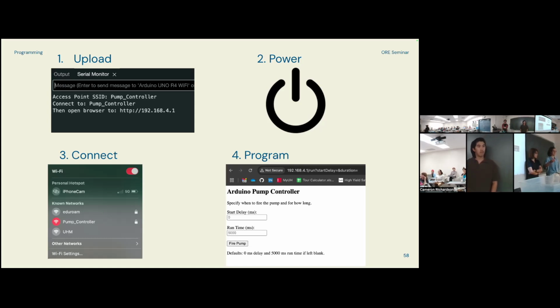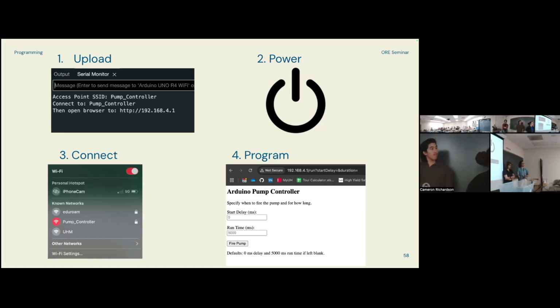You would add another whole copy of this setup to one of these boards here. You can take up to 8 different samples, like a rosette, and you would have to retrieve it. You would eventually have to take the sampling unit back off, but only when you retrieve it. If you want more samples, you can add sampling units.